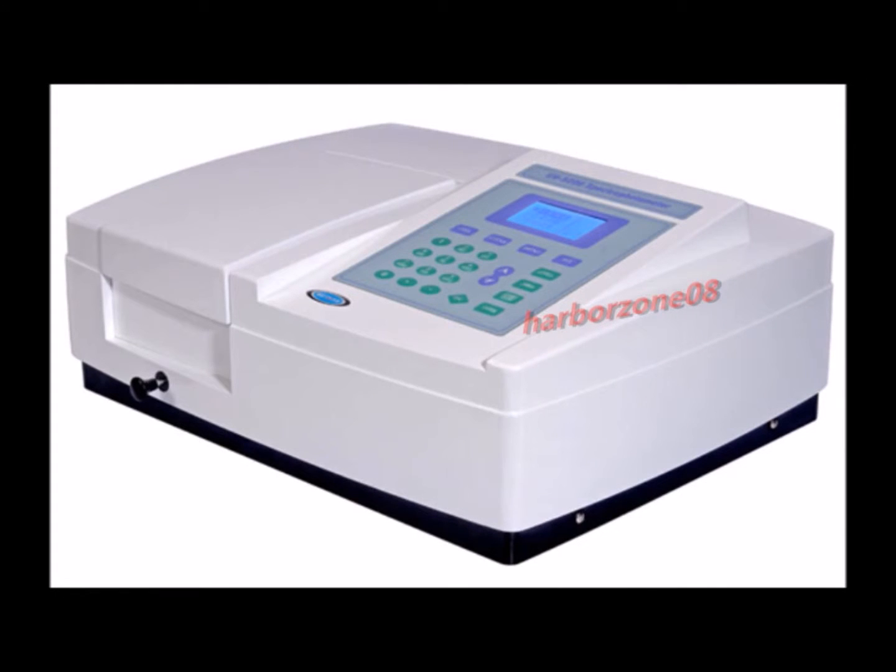Spectrophotometry. The concentration of a molecule in solution depends on the absorbed light by the molecules in solution. DNA absorbs UV light at 260 nanometers, and it allows to determine the concentration of this nucleic acid.